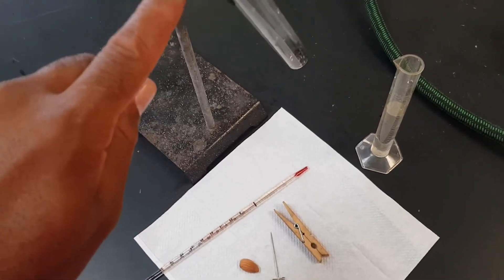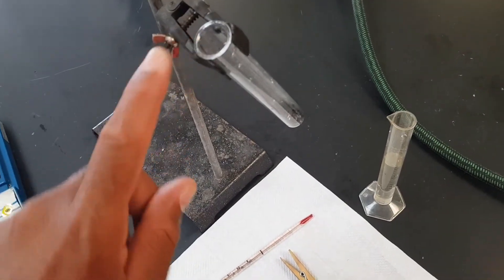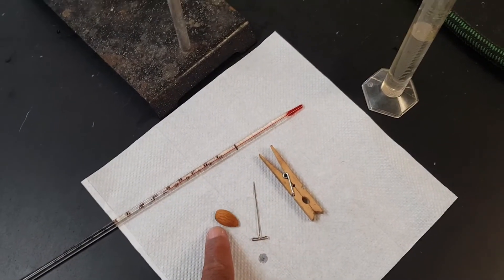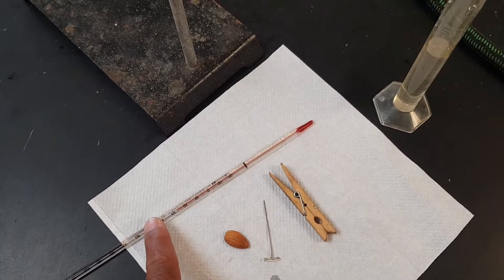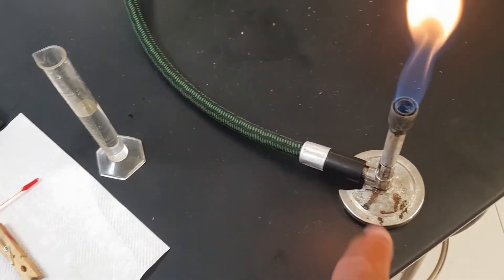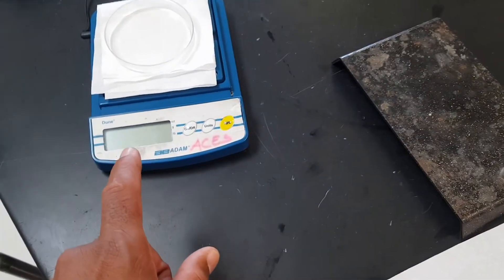So what do you need to use? We're going to use a test tube, T-pin, the nut, a thermometer, a clothespin, a bunsen burner, and a gram scale.